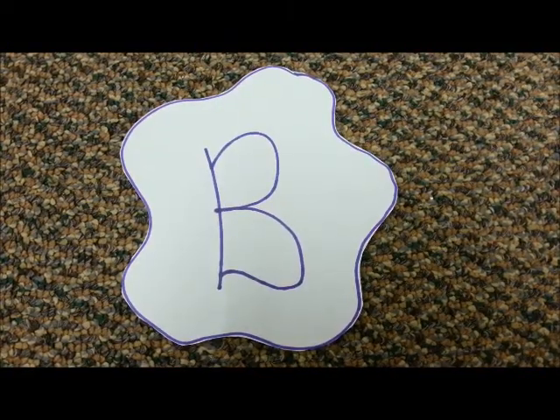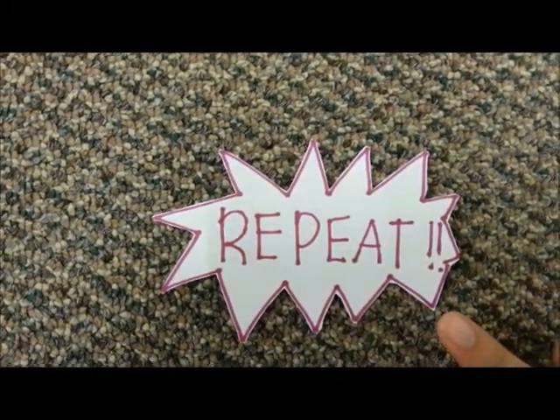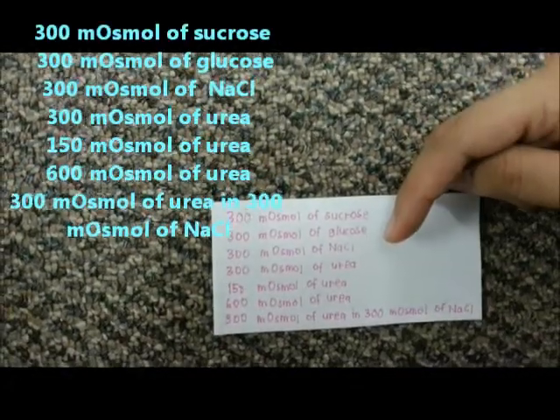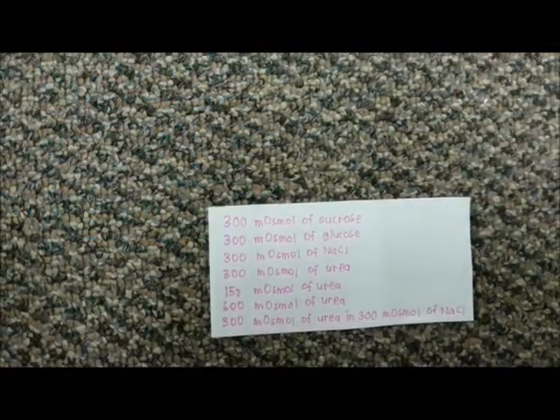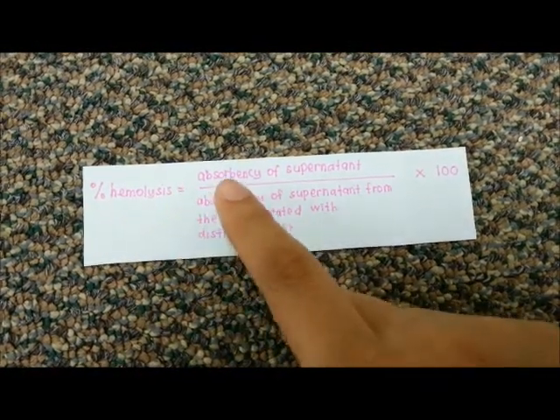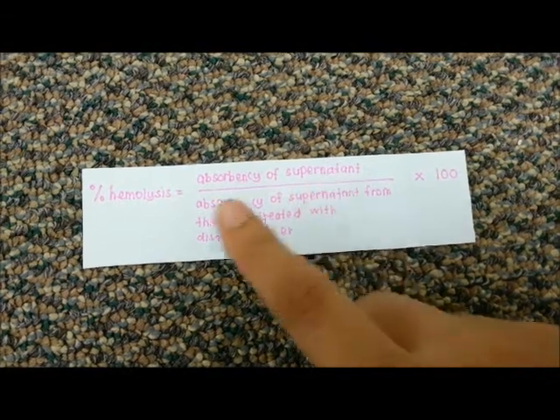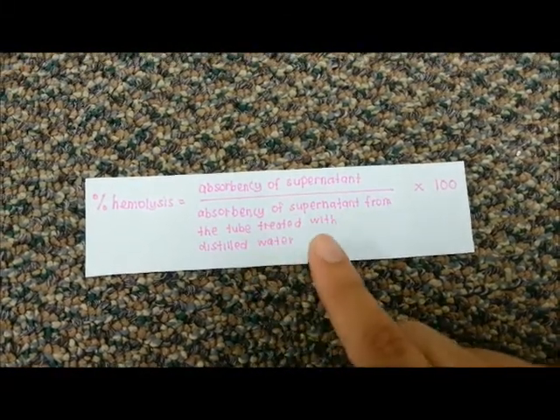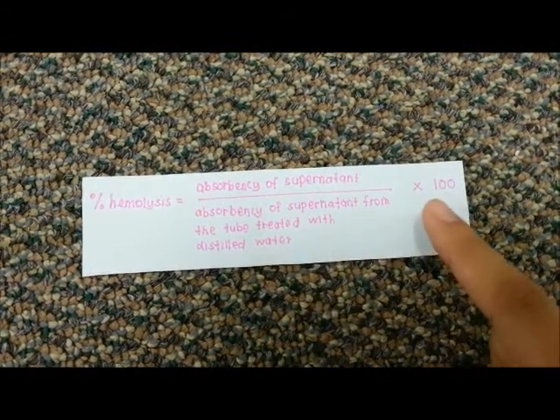In the last section, section B, repeat all the experiment with the same procedure as sections A1 and A2 by using the following solutions. Lastly, calculate the percentage of hemolysis for the supernatants by using this equation. Percentage of hemolysis is equal to absorbance of supernatant divided by absorbance of supernatant from the tube treated with distilled water, times 100.